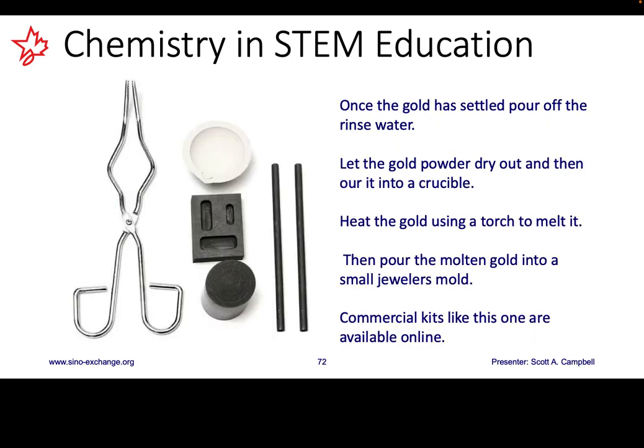At this point, you could melt down your gold, or you could purify it one more time by conducting another round of hydrochloric acid, followed by medium heat and stirring, followed by small amounts of nitric acid. After about 1 hour, you'll have an orange solution. And then you allow the solution to cool before adding sulfuric acid. This will react with any dissolved lead, which will precipitate out as a fine powder.